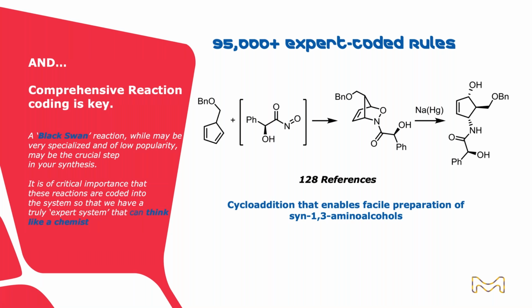They aren't published as much, there aren't as many records of them, but they can sometimes be really critical if you need to prepare that kind of scaffold. For instance, we have this cycloaddition reaction for preparing these Syn-1,3 amino alcohols that, at the time we encoded a rule in Synthia for it, had only 128 references. That's plenty of information for our human chemists to understand and map out the scope of the reaction, but it is far below the current thresholds of what you need for machine learning.